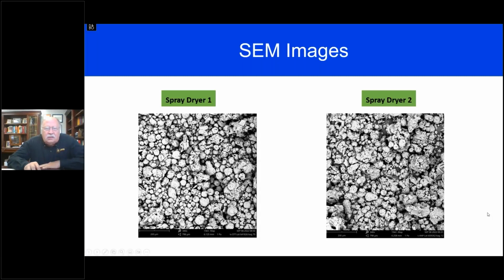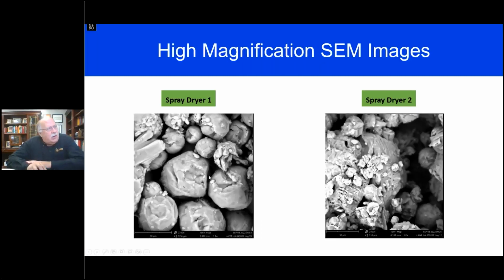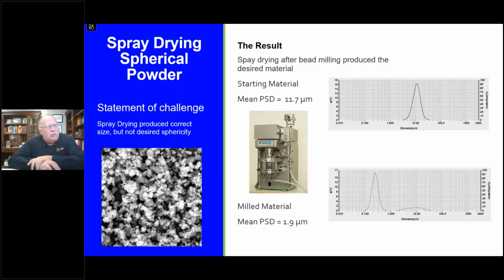If we take a look at this at a little higher magnification, you can see in dryer number 1, they're relatively spherical, but you can see some odd kind of structures in here. But if you look at dryer number 2, holy mackerel, what the heck is that, Batman? I look at that and I kind of wonder where did this particle come from? At the end of the day, I'm going to come back to this, but I want to leave you with the first thought on this was it was a spherical issue, but we didn't have an idea to begin with why we were seeing the differences between dryer 2 and dryer 1. Very, very odd. Let's go on to the second example, and I will come back to this, and we'll talk about what this really means.